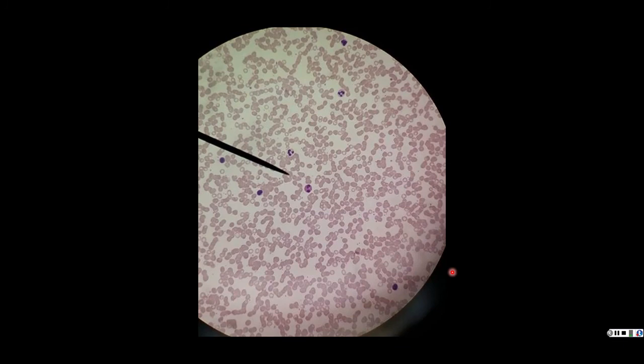So let's go ahead and take a look at what we would see were we to look through a microscope with a stained blood slide in place. Now, blood has several different features, and most of them are extremely small and require pretty decent magnification. You really won't see too much on scanning power, and even low power can be a little bit difficult. So what we're going to be looking at are either high power images or even in some cases oil immersion.